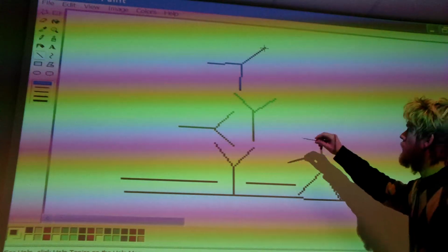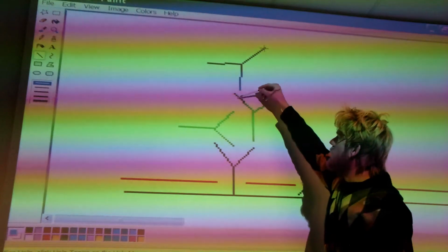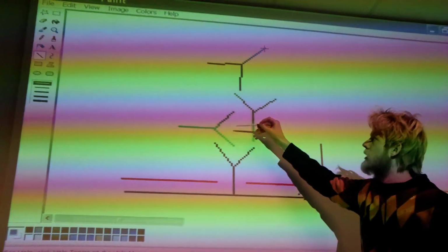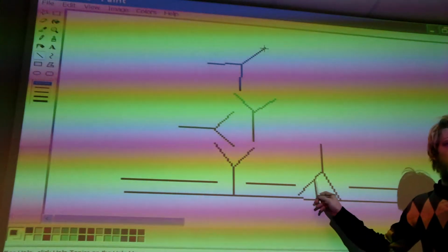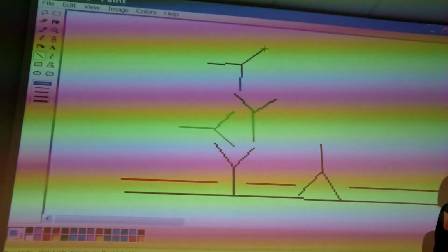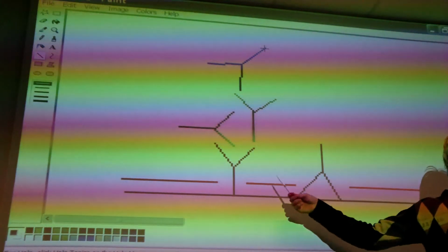Alright. I would say it does not matter if this binds here, or if it can bind here, or here, or here, or here. Or if this is really specific for any antibody at all. But it can bind to the primary. It could bind to this. That's okay. And to the other one that already is bound to that one. So that's maybe, I don't know, a distortion of the signal. But if you quantify the signal in the end, and you have a control where you just have this as well, then you can just subtract it. Okay, so that's an important point.